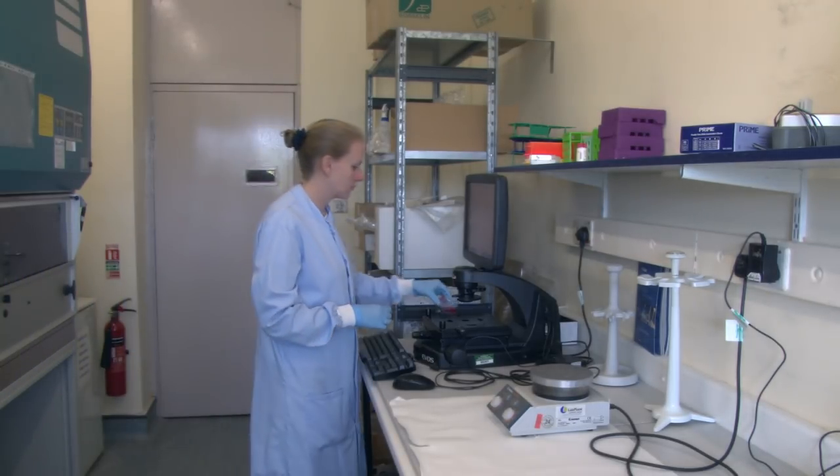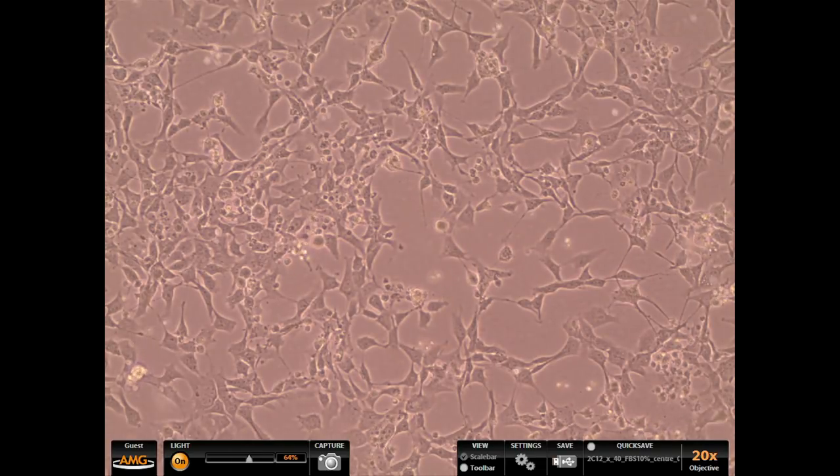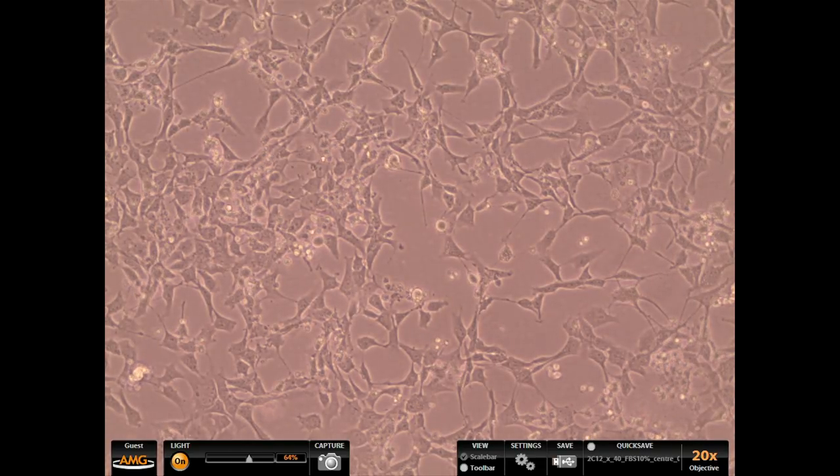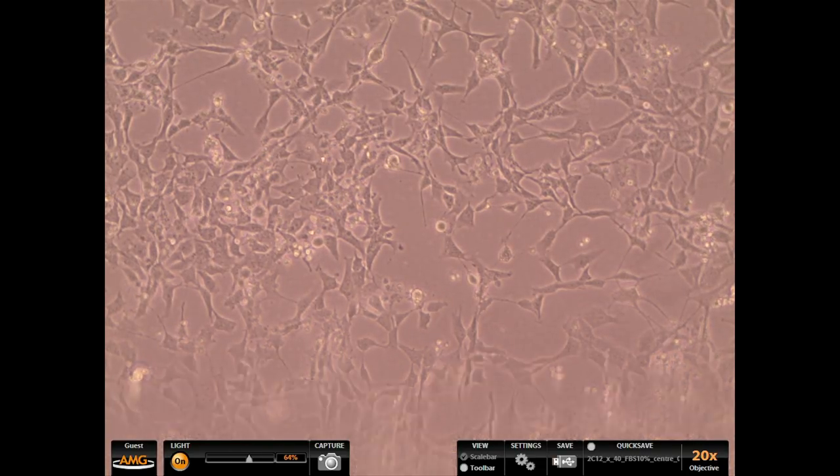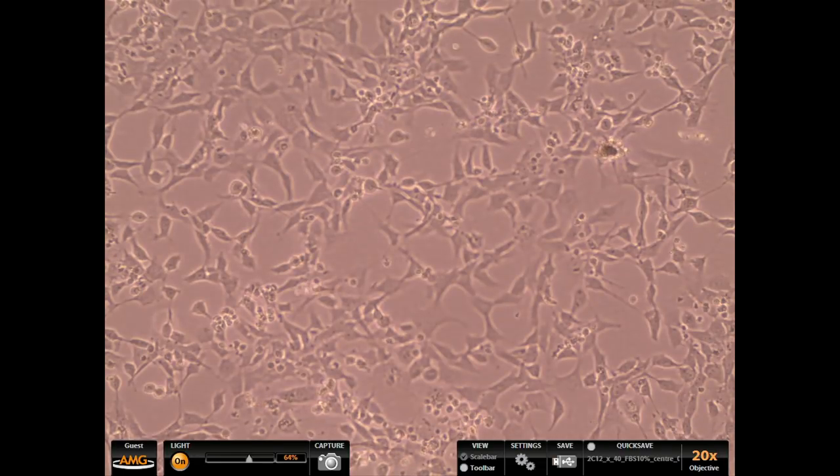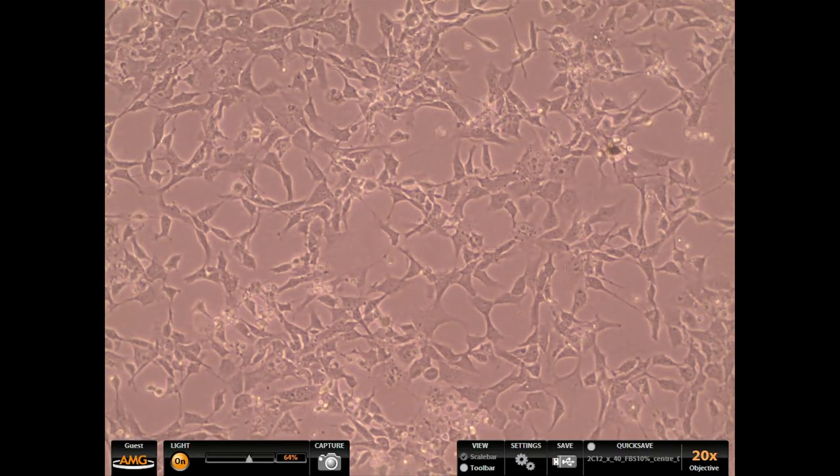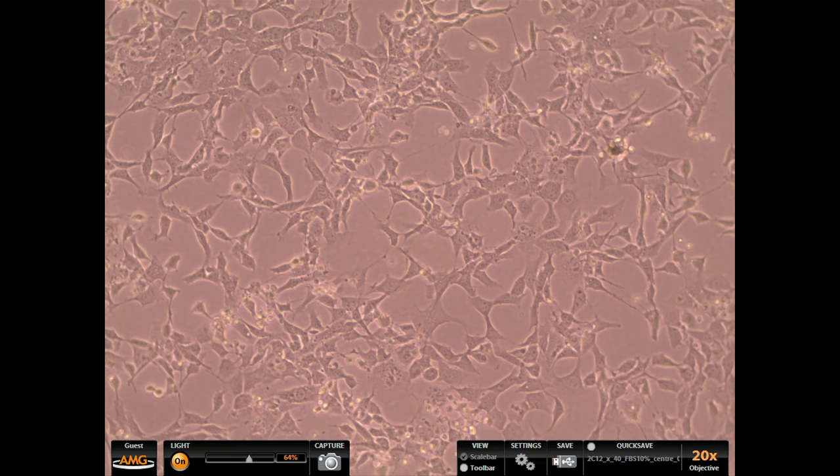Put the flask onto the microscope platform. Look carefully at the culture. Check that there are enough cells. Approximately 80% of the flask surface should be covered. Also check that the cells are well grown and that nothing is contaminating them.